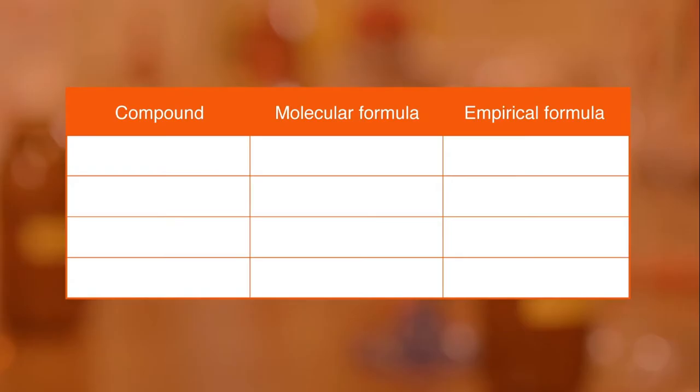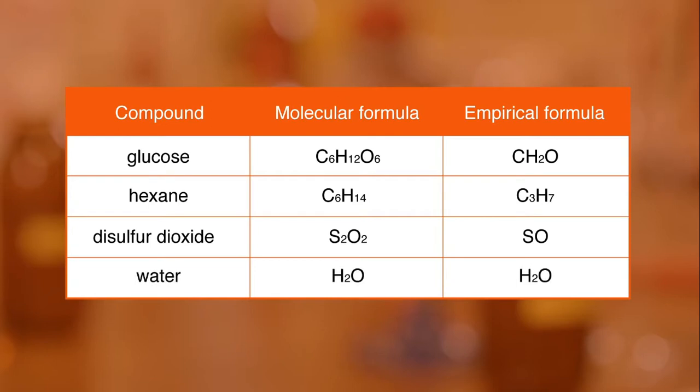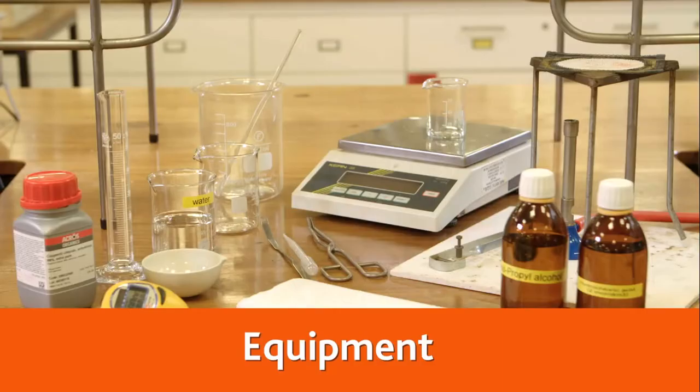The empirical formula of a compound is its simplest possible formula. It gives the proportions of the elements present, not the actual numbers or arrangement of atoms. An empirical formula is identified from the mole ratio of the elements in a compound. This experiment uses a displacement reaction for determining the empirical formula of copper chloride. Empirical means by experiment.